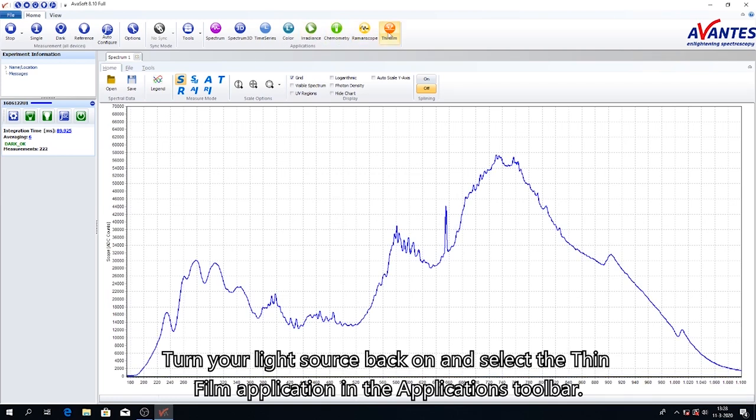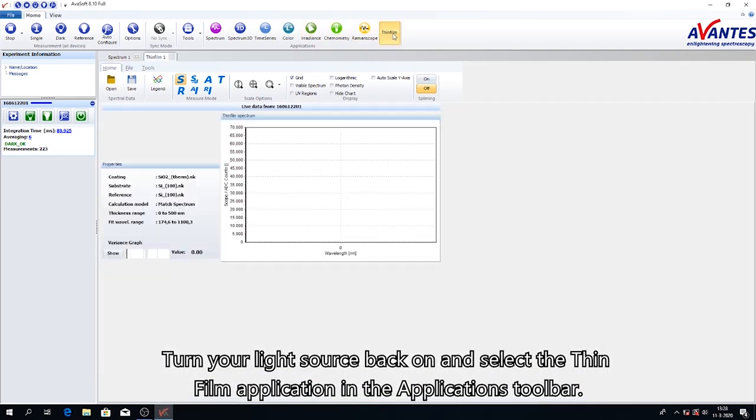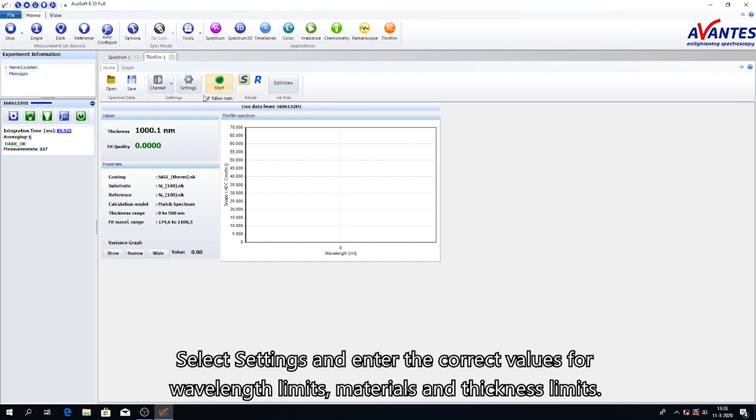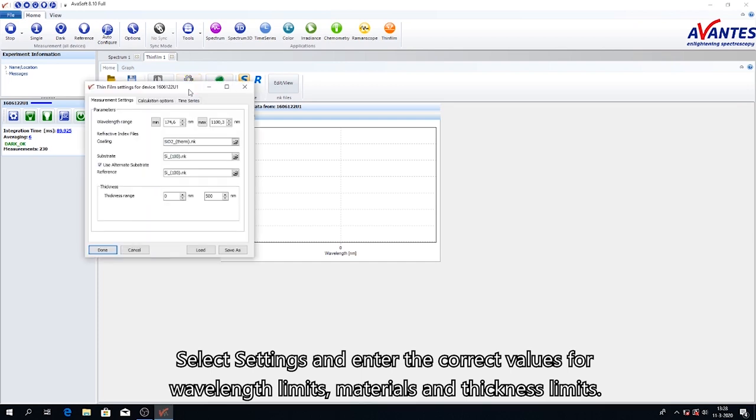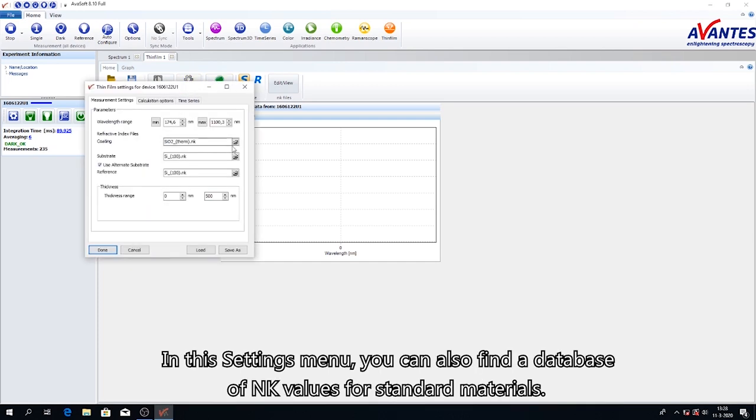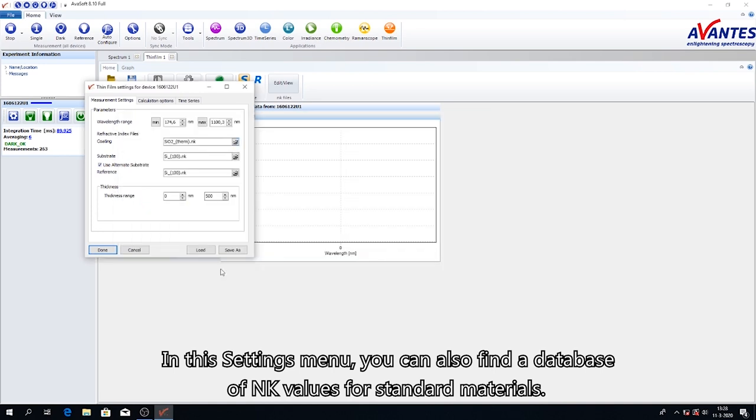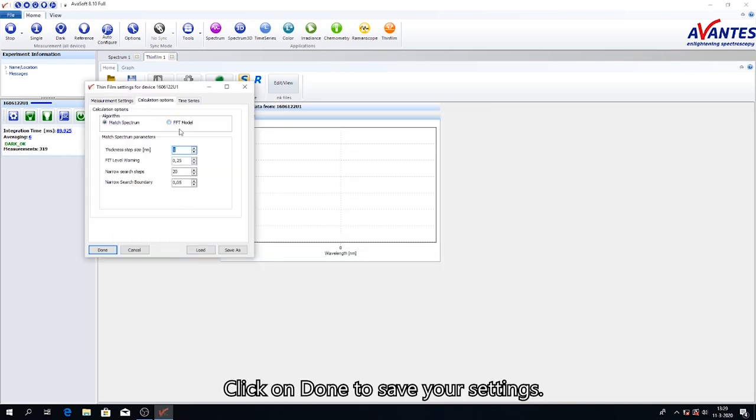Turn your light source back on and select the thin film application in the Applications toolbar. Select settings and enter the correct values for wavelength limits, materials, and thickness limits. In the settings menu, you can also find a database of NK values for standard materials. Click on Done to save your settings.